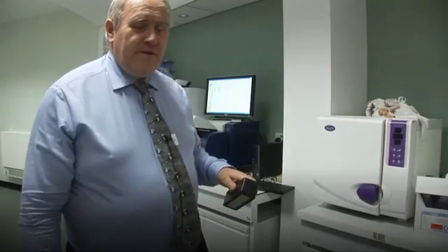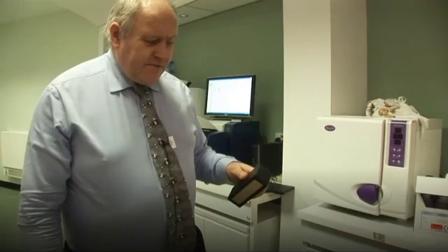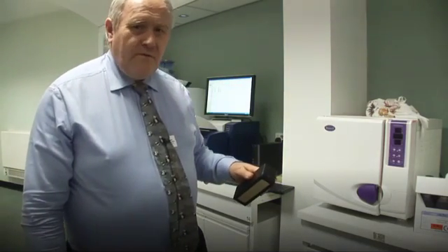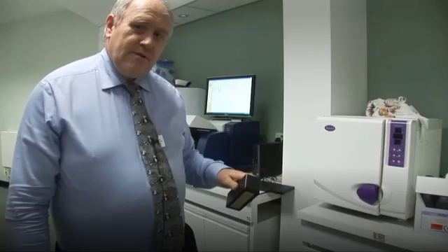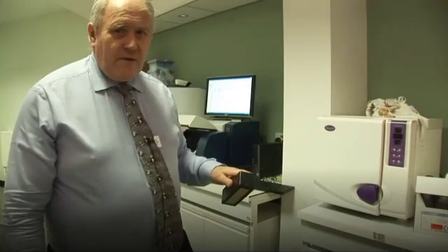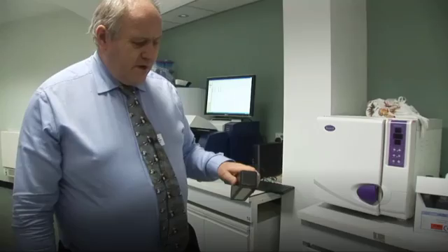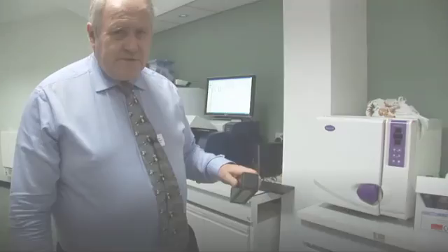One of the remarkable things about this technology is the fact that in two minutes we can have a set of results that would take up to 12 hours if we were using standard wet chemistry in a laboratory. Clearly this technology has great advantages in terms of timeliness and cost effectiveness.